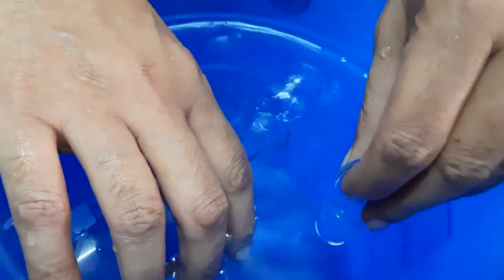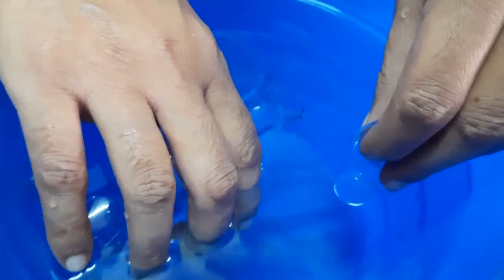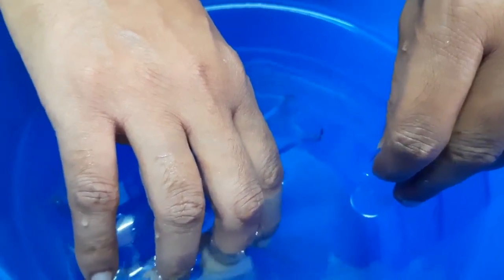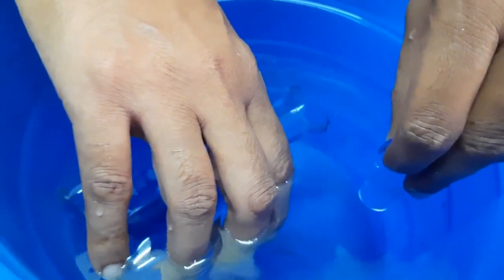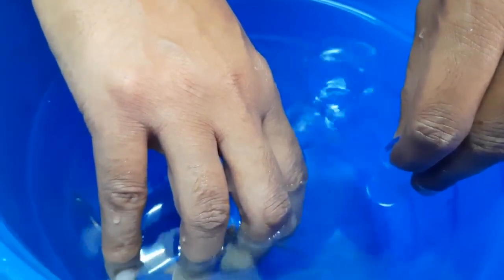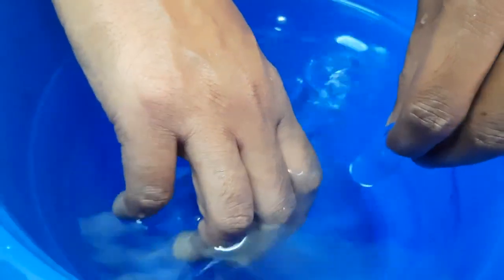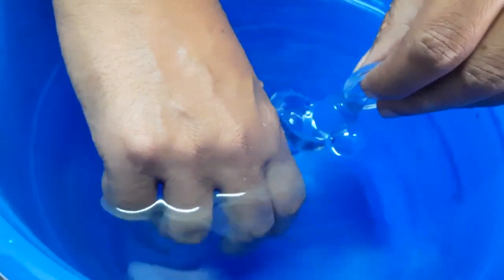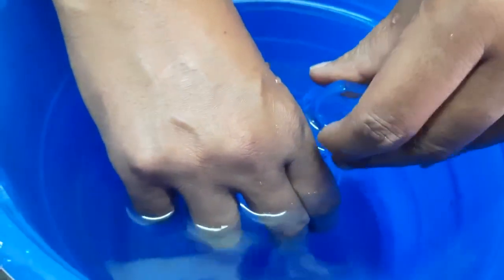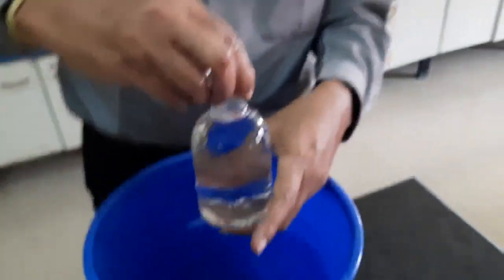The BOD bottle has to be immersed in the water. Because we are doing it with tap water, I am showing it to you in the tub, but when you are collecting the water sample from water bodies, the BOD bottle has to be completely immersed, and you make sure that you stopper the bottle within the water itself, to ensure that external oxygen doesn't enter into the bottle.